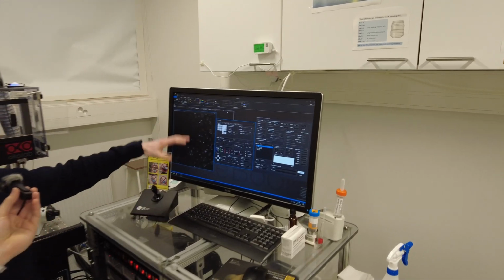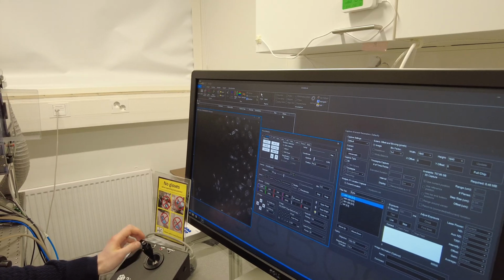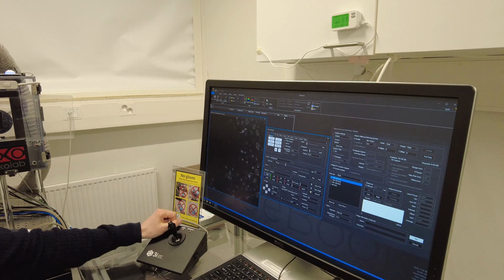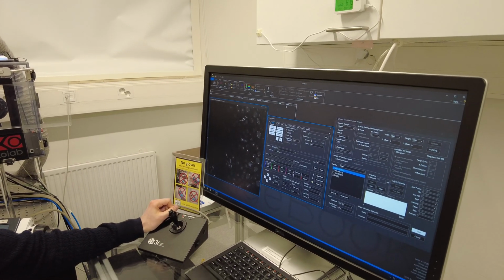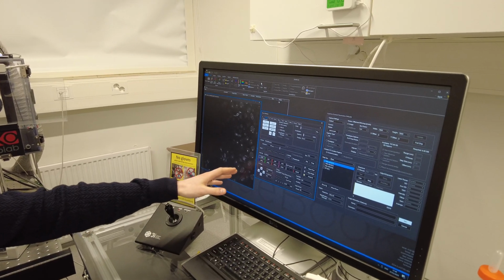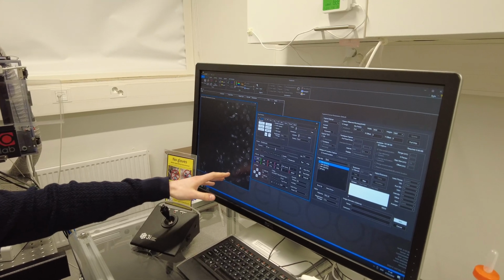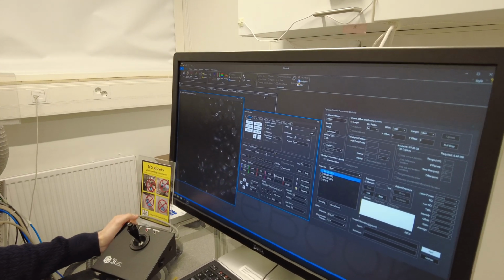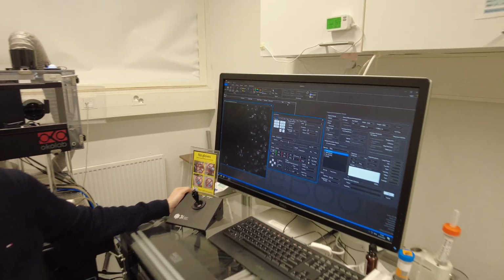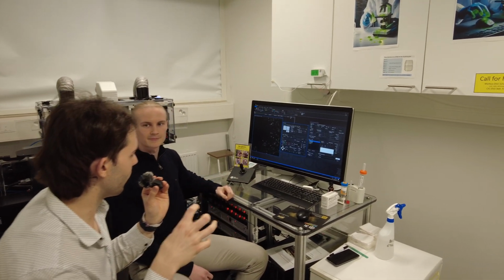This is one cross section of a seminiferous tubule inside the testis, and here we have the epithelium of the seminiferous tubule with the developing male germ cells. The first cells are close to the border of the epithelium, and closer to the lumen we have the developing, almost ready sperm cells. Wow, interesting.